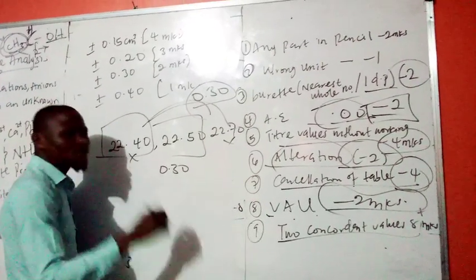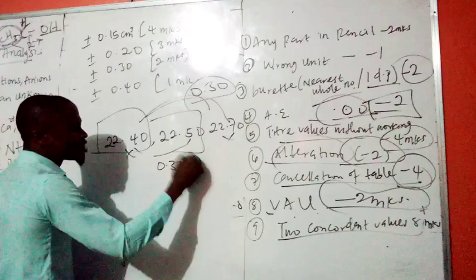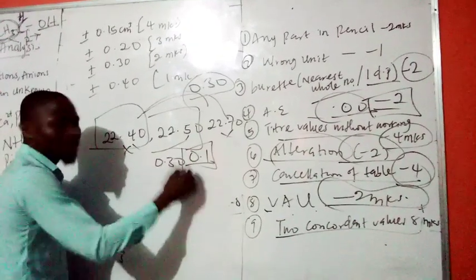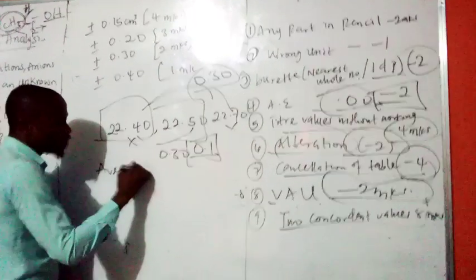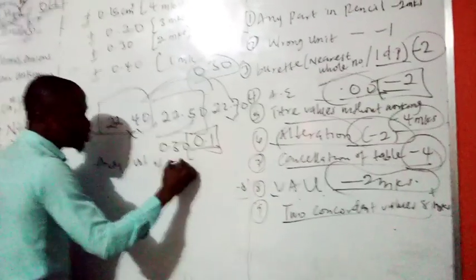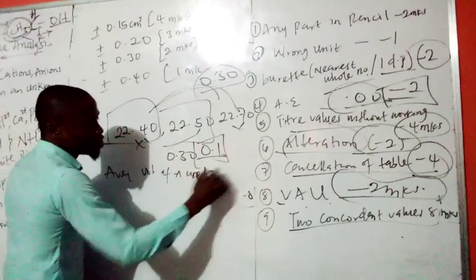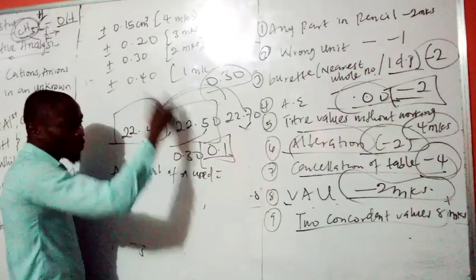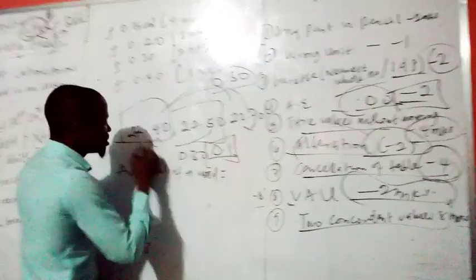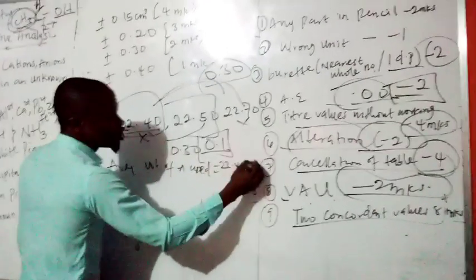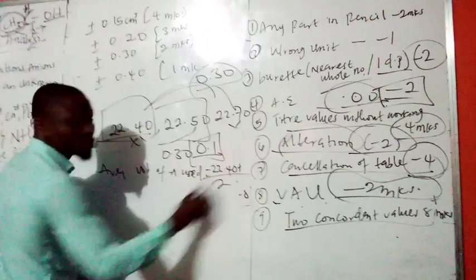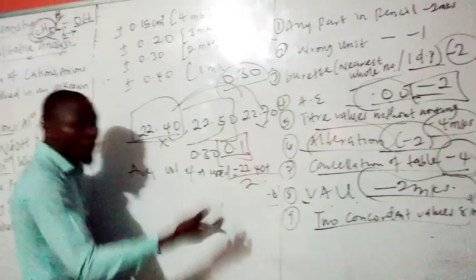In fact, you can actually try your best so that the difference would be 0.1. If you do that correctly, and that is to say average volume of acid used, of acid used, you know it would be the volume of acid for any of the titer, maybe one. Then you can use 22.40 plus 22.50 divided by 2 to get 22.45.